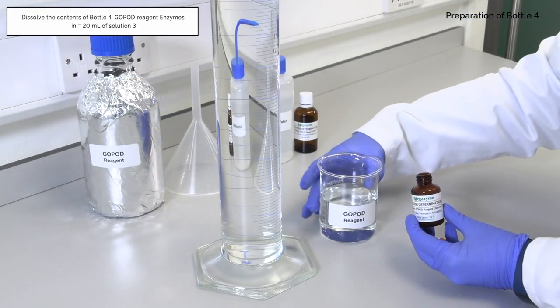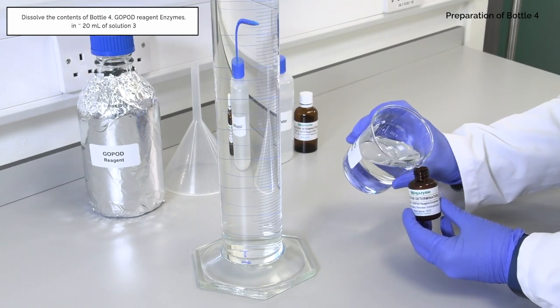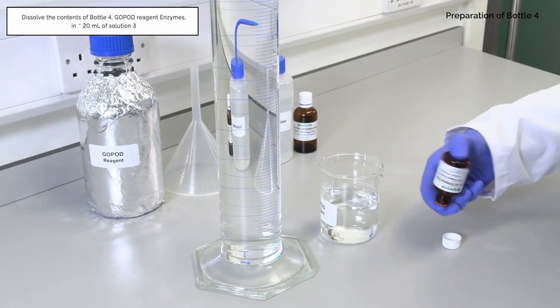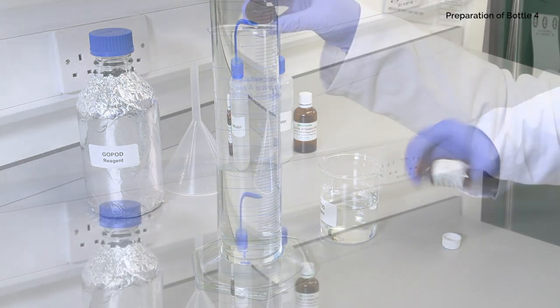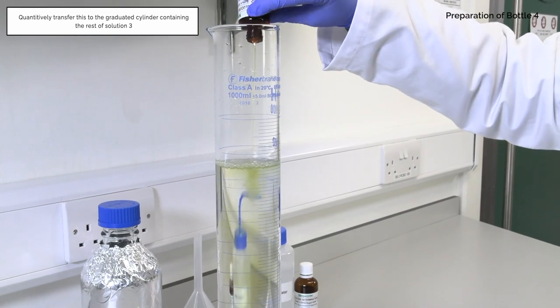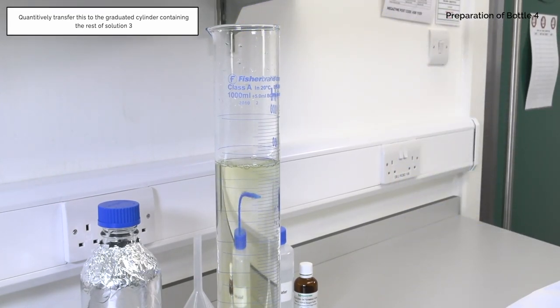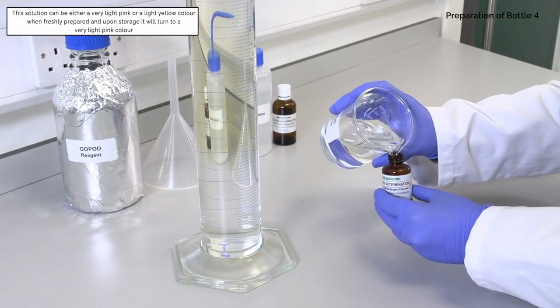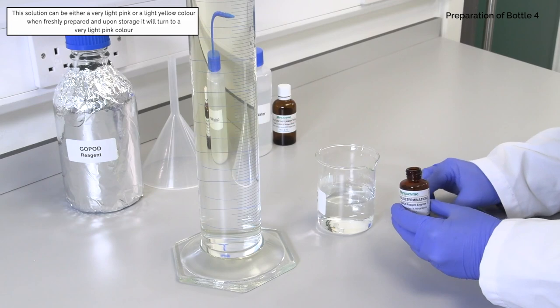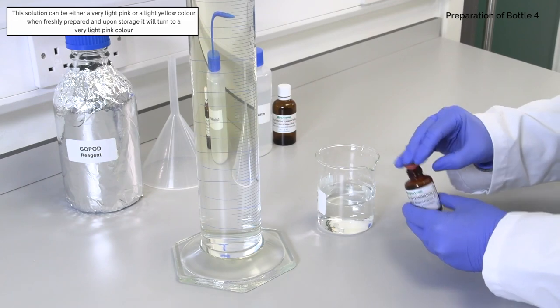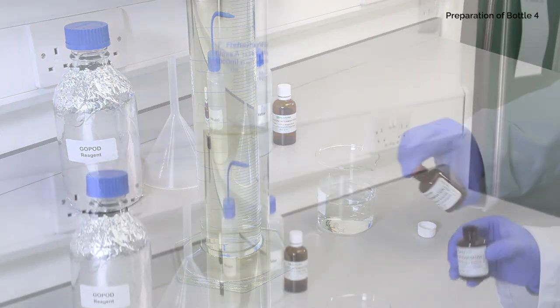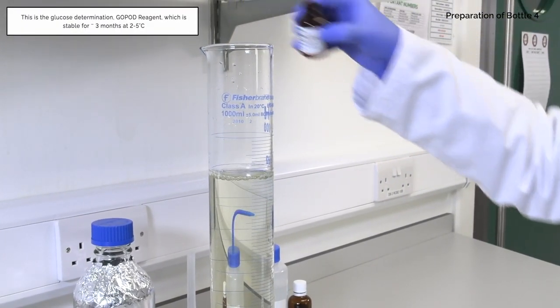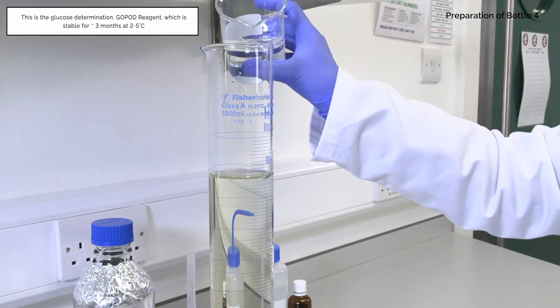Dissolve the contents of bottle 4, GOPOD reagent enzymes, in approximately 20 milliliters of solution 3. Quantitatively transfer this to the graduated cylinder containing the rest of solution 3. This solution can be either a very light pink or a light yellow color when freshly prepared, and upon storage it will turn to a very light pink color. This is the glucose determination GOPOD reagent, which is stable for approximately 3 months at 2 to 5 degrees Celsius.